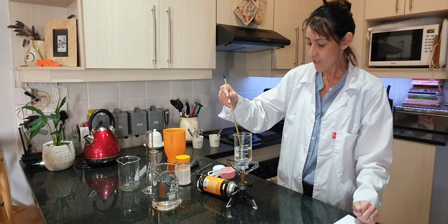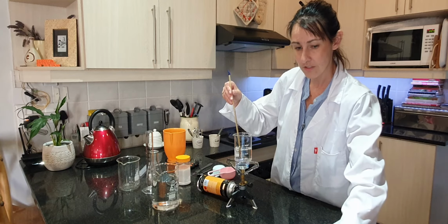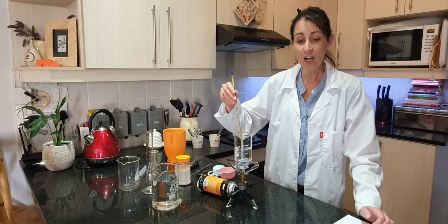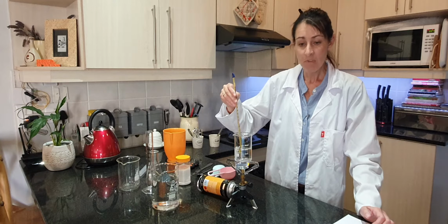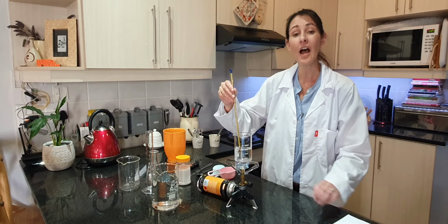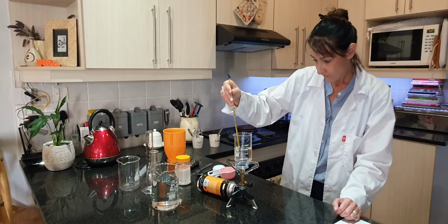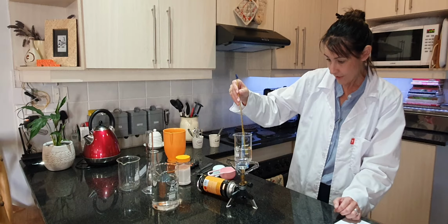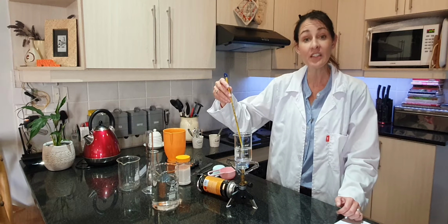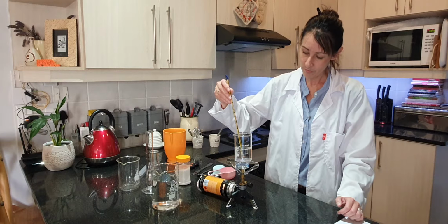Getting quite warm. In your practical, I just want to go down to the table. Under results, you have a table that says contents of the beaker and then the boiling point. The contents of the beaker, this one is just the 150 mils water. So we want to see what this one's boiling point is. At the moment it is now 70 degrees.